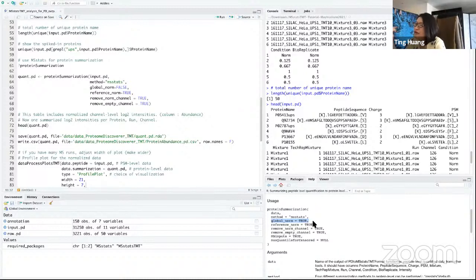Or if your data set does not have a large number of proteins, such as the toy example here, which only has 50 proteins, that is almost as few as in targeted proteomics. For such a case, this assumption is maybe not applicable, so this normalization is not applicable.